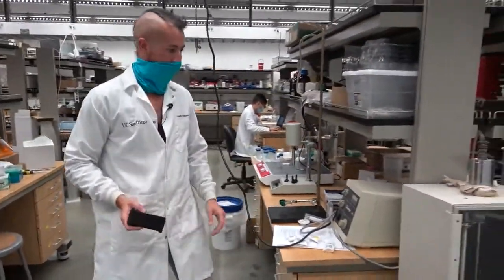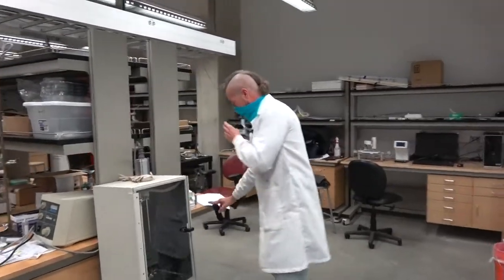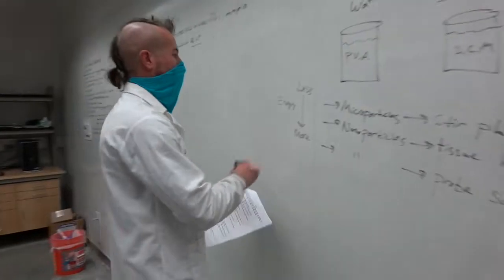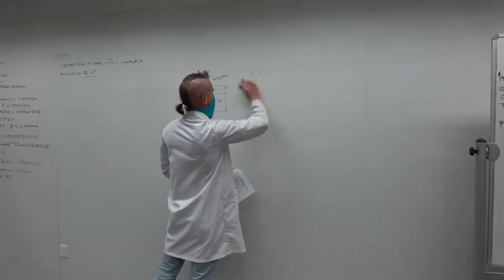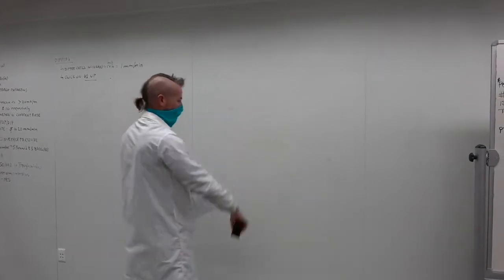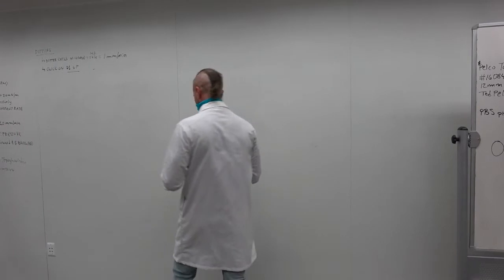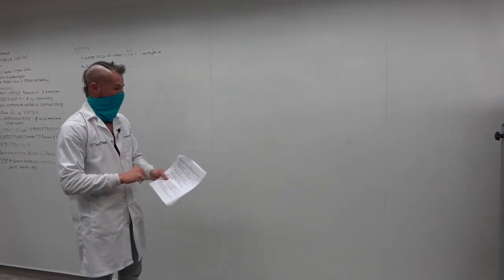Okay, where's my protocol? Here. Okay, so relatively simple.